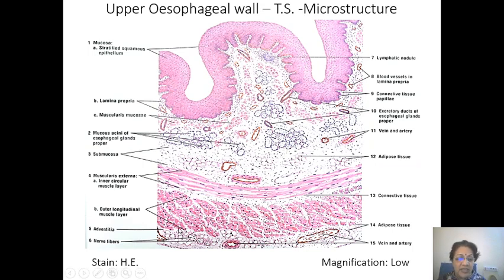Then outside we have the adventitia, where you have adipocytes, and you have some nerve fibers here, better visible because they're bigger branches of the nerves. Their finer branches are here, the finest branches are here, and here you won't see any nerves at all.